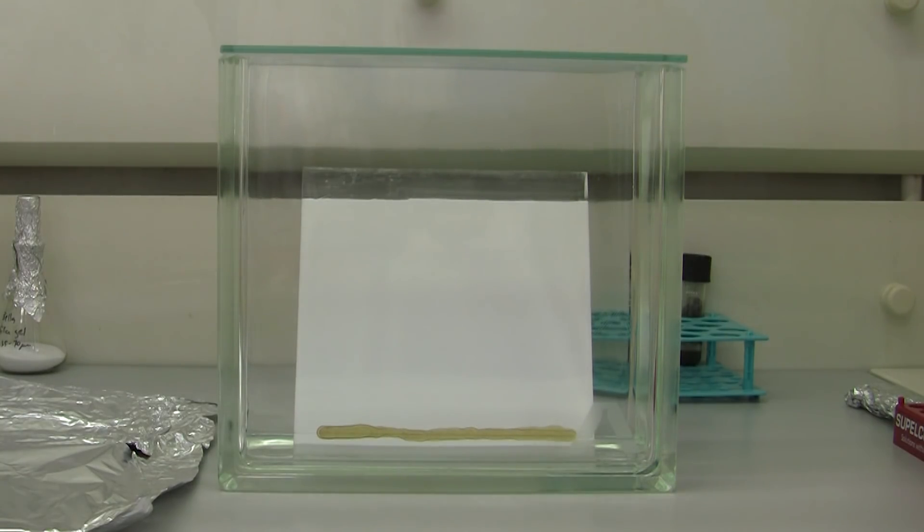It is like a slow race. Some pigments are smaller and faster, some others need more time to move. More and more all our different pigments get separated. All these different colors represent different species.